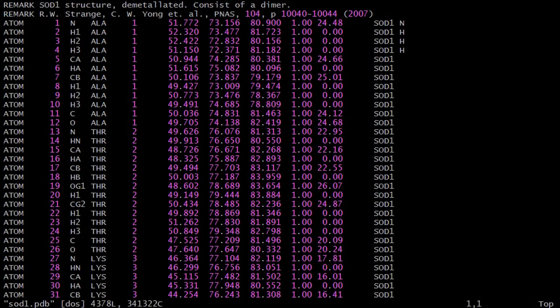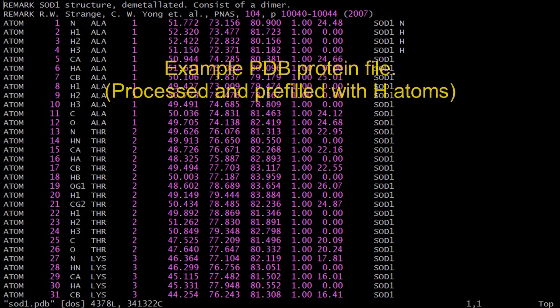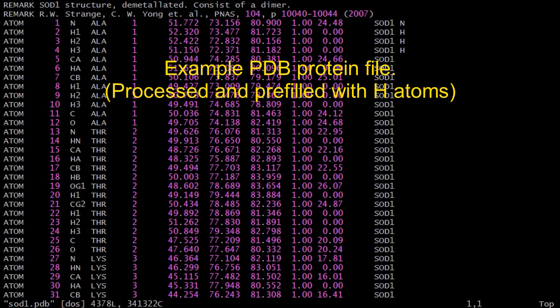The example shown here is a typical PDB protein file. Note, molecular structures downloaded from the protein databank would need further processing such as removal of multiple occupancies, addition of hydrogen atoms, and so on.